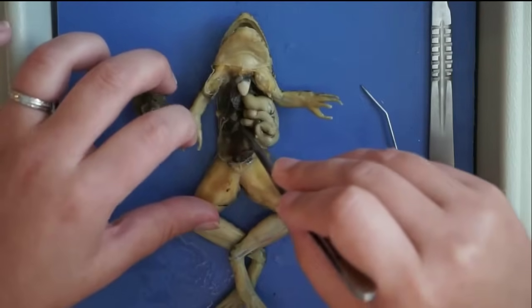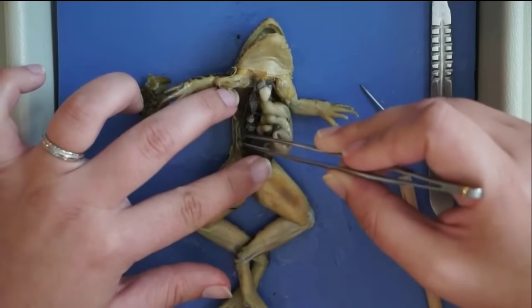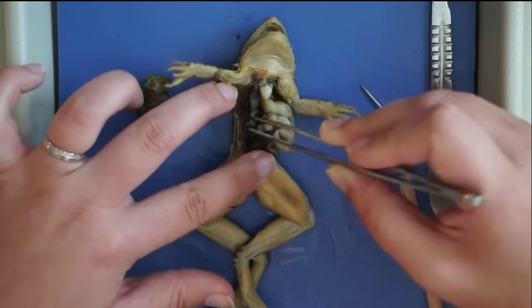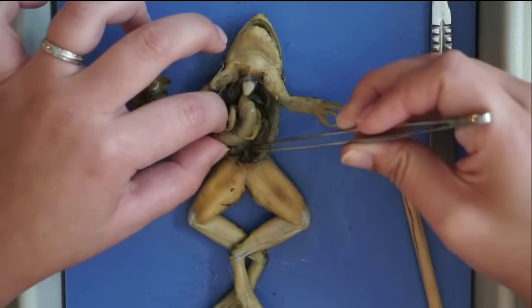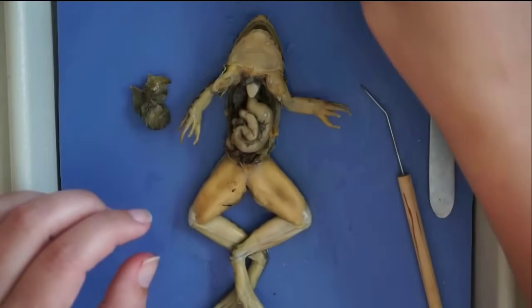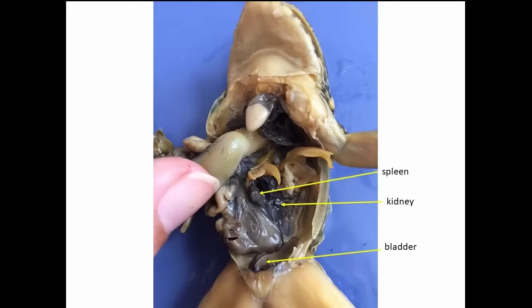There's one kidney on that side and one on the right side as well. There's also a bladder that the kidneys filter urine into — the frog's bladder is pretty empty at the moment — and that will all empty out into the cloaca. Here are some of the structures we just looked at: the spleen, kidney, and the bladder.